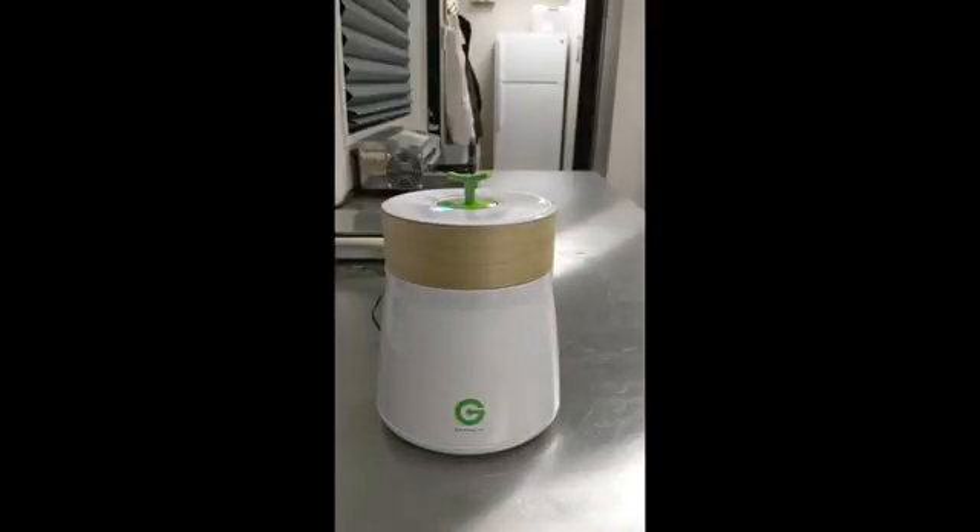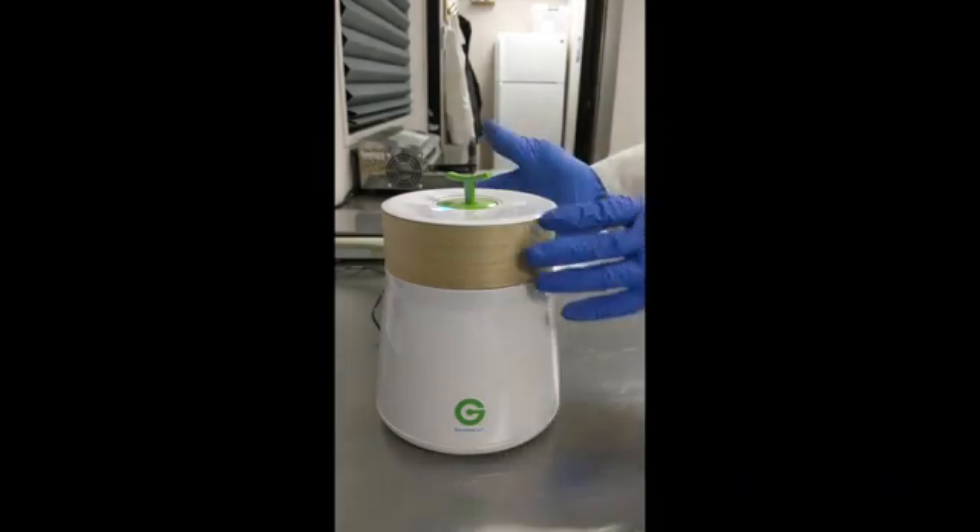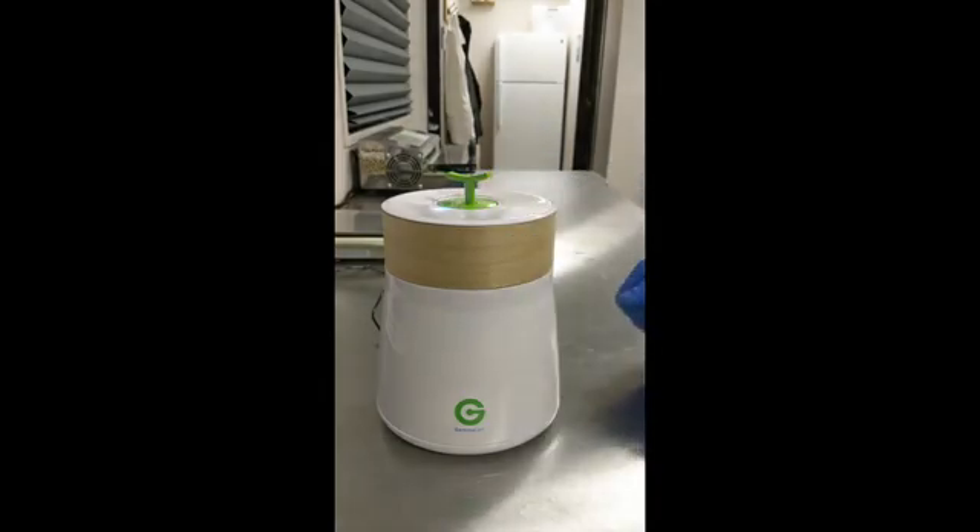Hey everyone, in this segment I want to showcase our Gemisert Cannabis Profile device. This is a very lightweight, simple, portable device that is used to analyze the cannabinoid content of your cannabis flower.